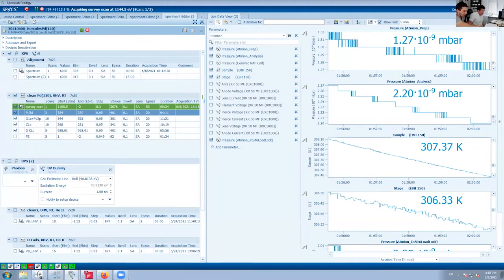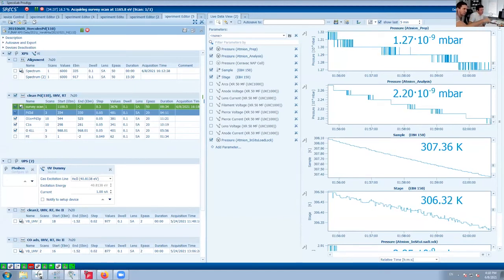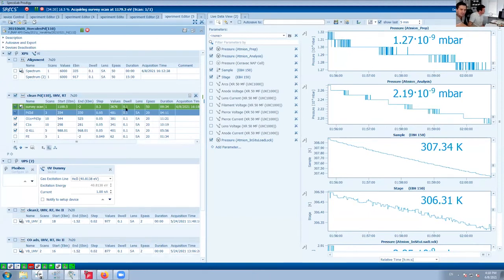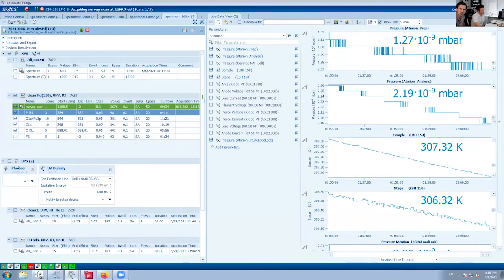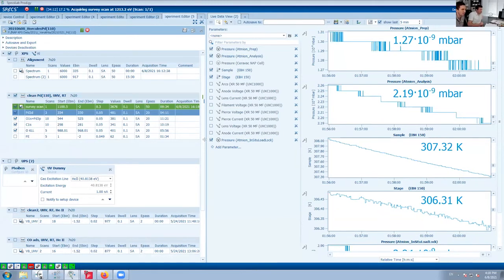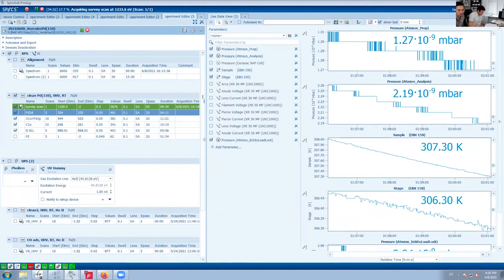When the measurement happens, the step is how the software changes the energy and measures intensity. Also, you can change the dwell time. As soon as the analyzer changes the measuring energy, it should wait there for some time. So this is dwell time, the time the analyzer waits at the measurement point. The longer it waits, the more electrons it catches, so the signal becomes higher. But of course, then the spectrum is measured much more slowly.